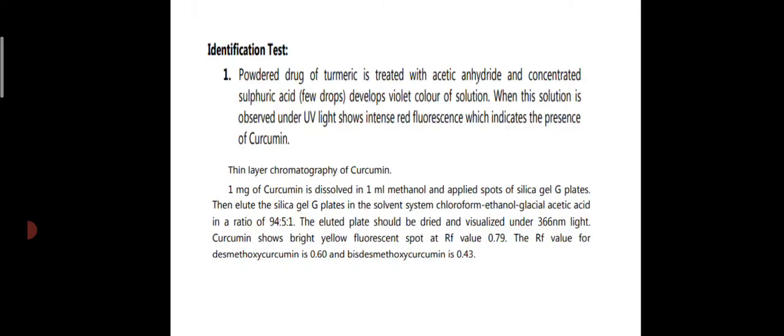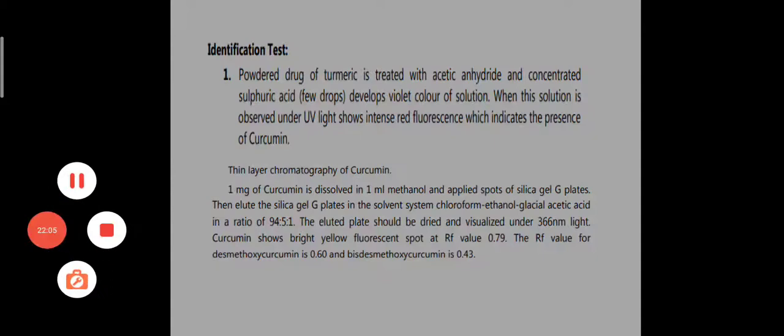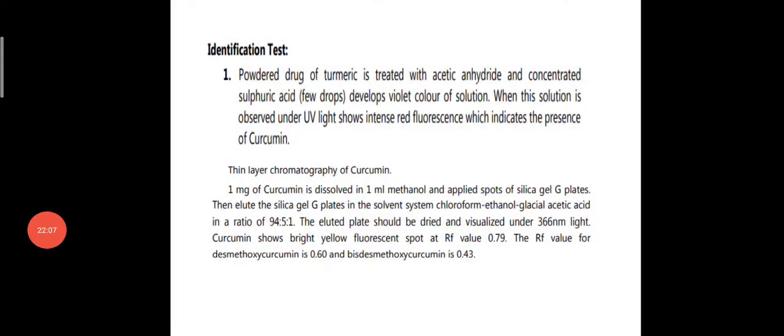The identification test: in that, we take the powdered drug, the isolated curcumin. It is treated with acetic anhydride. Then concentrated sulfuric acid is added drop wise. It shows violet color of solution.